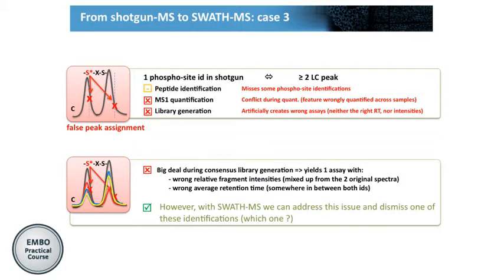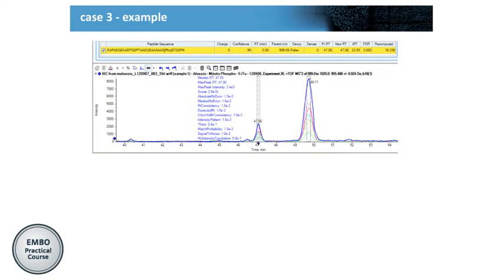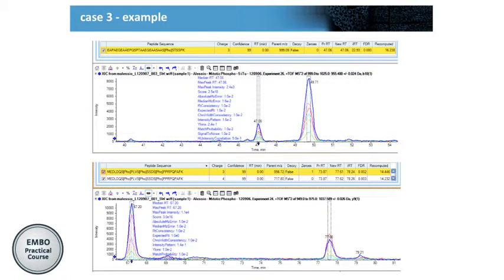in order to avoid mistakes when we're quantifying 2 different peaks across runs. And here's an example where we extracted 1 phosphopeptide, but it gave 2 peaks, and then we can afterwards try and resolve which one is the right one. Here's another example, and you can see that here the separation in time is already quite considerable. So you can have different cases where you think you're extracting 1 peak, you actually get 2, but it has also a very big advantage.